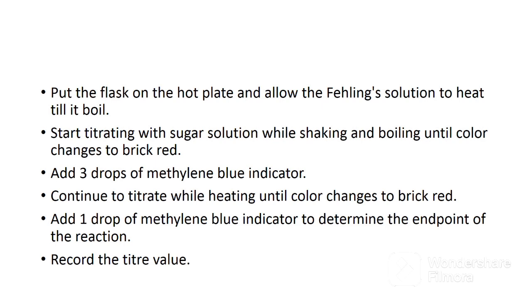Add 3 drops of methylene blue indicator and allow the solution to boil for a few seconds. Continue to titrate slowly while heating until the color changes to brick red. Add 1 drop of methylene blue indicator to determine the end point of the reaction — if all the oxidizing agent has been reduced, the 1 drop added will automatically turn brick red. Titration should take a minimum of 4 minutes, and for accurate results, at least 3 titrations should be performed.